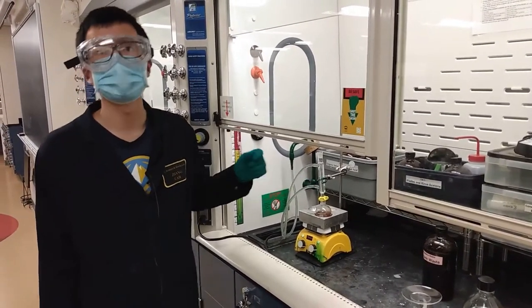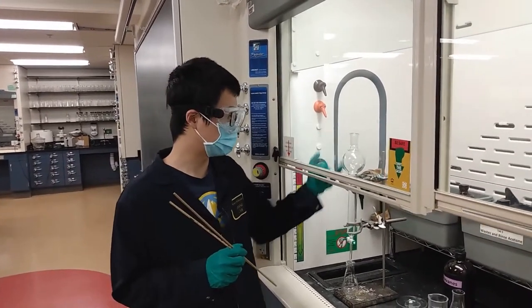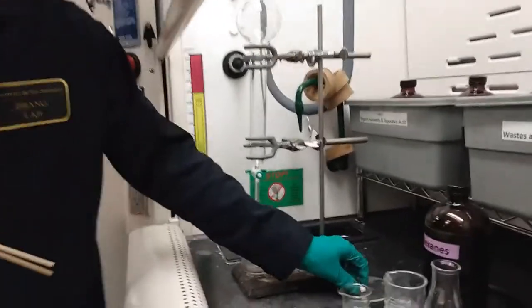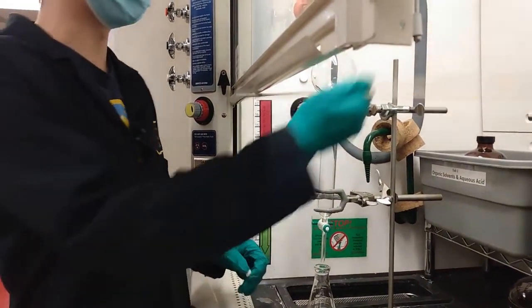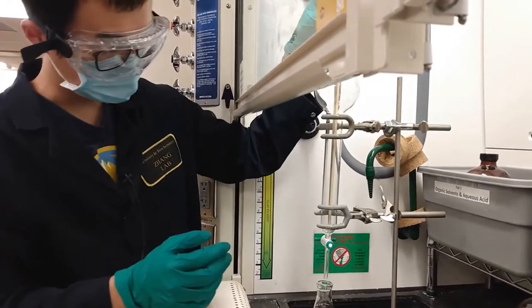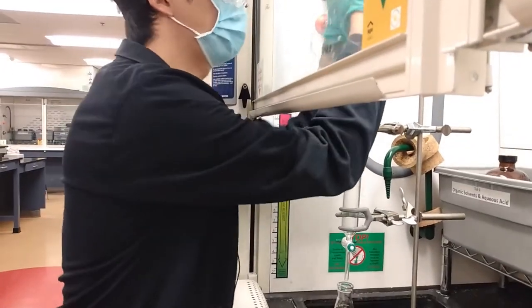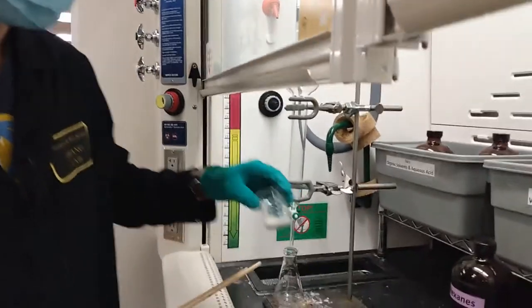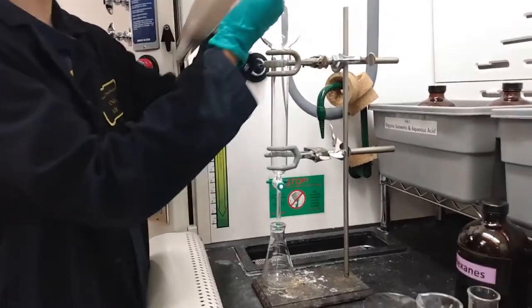To separate our product, we need to set up a column. This is the large-scale column. First we need to put this bottom ball inside the column and use two sticks to push it down like that. You can see I have already put the cotton at the bottom. Next we need to add some sand to the bottom, just on top of this cotton.